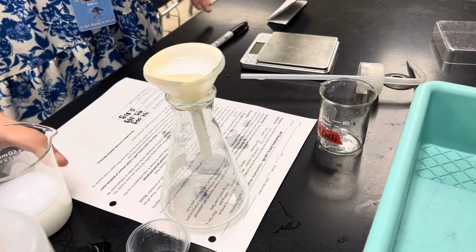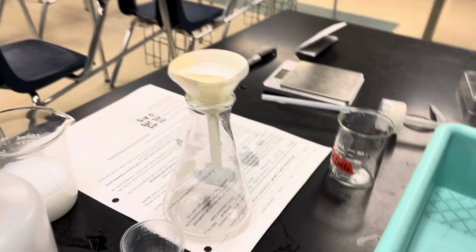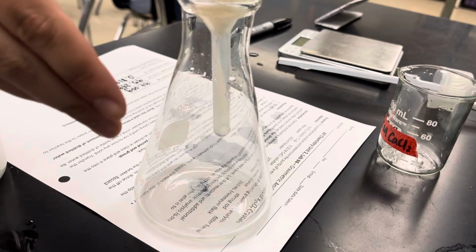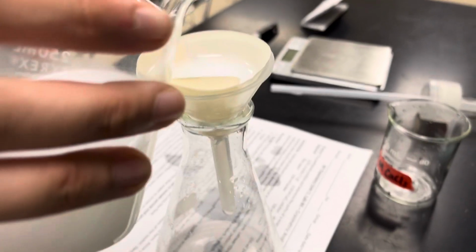And so you just have to sit here for about 20 to 30 minutes watching it all drip. So you kind of see it's dripping on the bottom. It's gonna drip very slowly. And eventually the bottom is going to be all of this colorless liquid and the top is just gonna be the chalk.